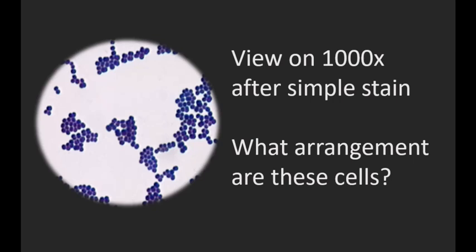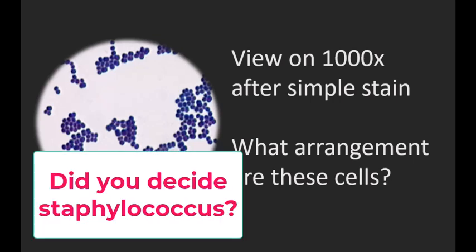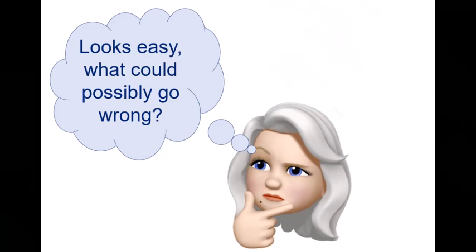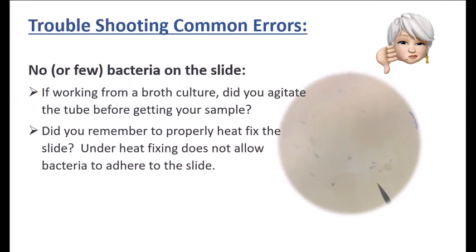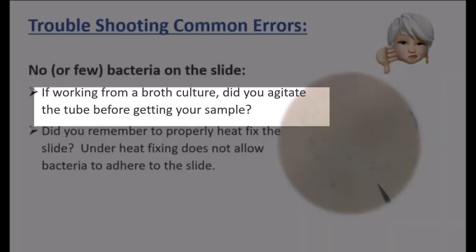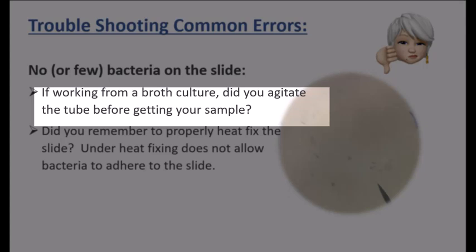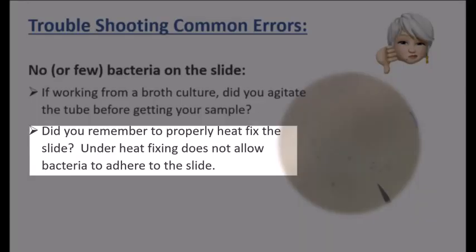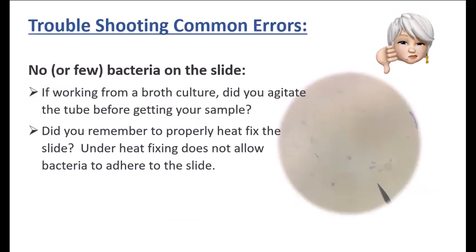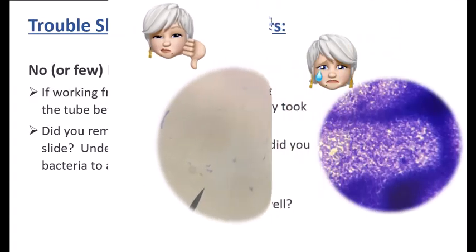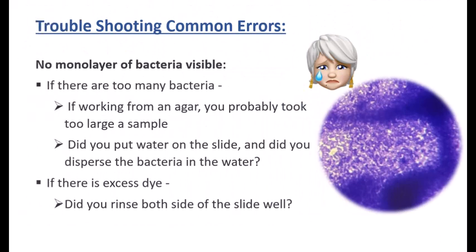So there you have it. That's easy. What could possibly go wrong? Well, I'm glad you asked. Here's some common errors. If you look under that microscope and there was no bacteria or very few bacteria on the slide, think about this. If you were working from a broth culture, did you remember to agitate the tube before you got your sample? Did you remember to properly heat fix the slide? Underheat fixing does not allow bacteria to adhere to the slide.